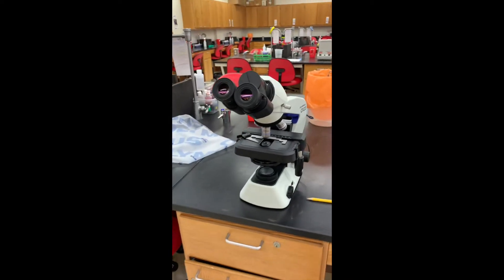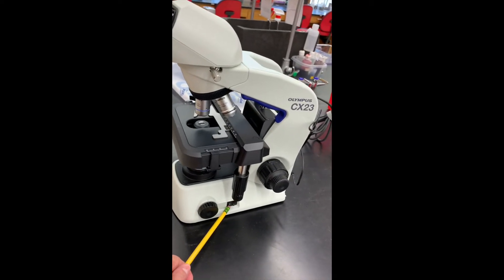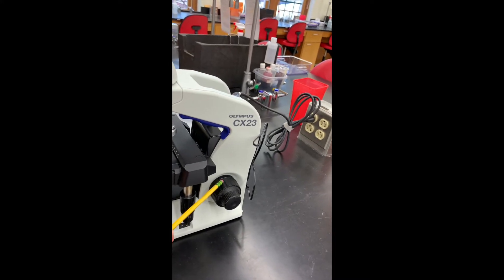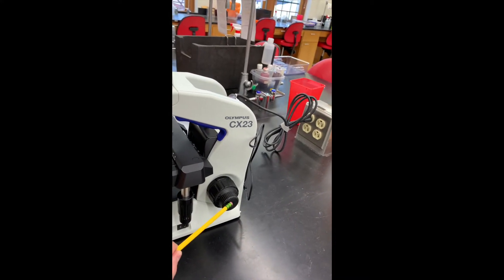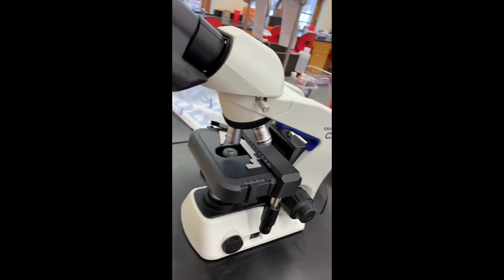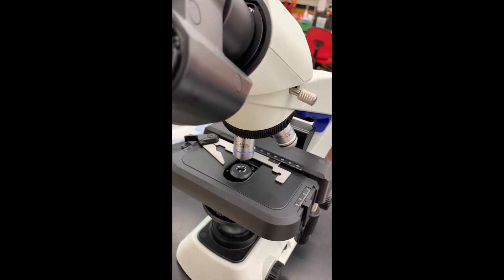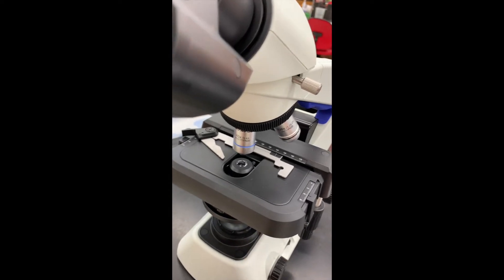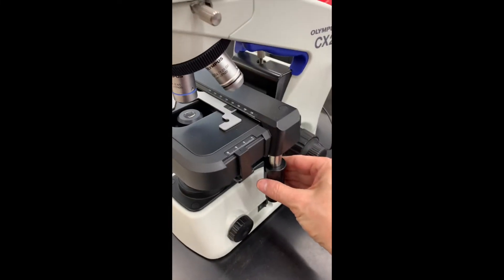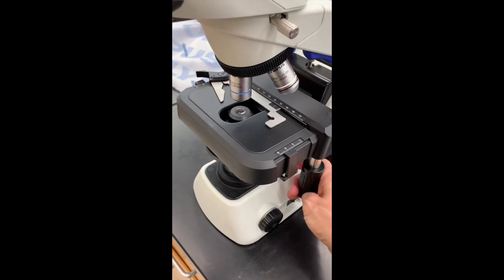Let me point out some of the key parts. Here's the power button. This is the coarse adjustment. This is the fine adjustment. This is the stage. You use this clip to open it up to put your slide on and it should hold the slide in place. To move the slide, you use this to go forward and back and this to go side to side.